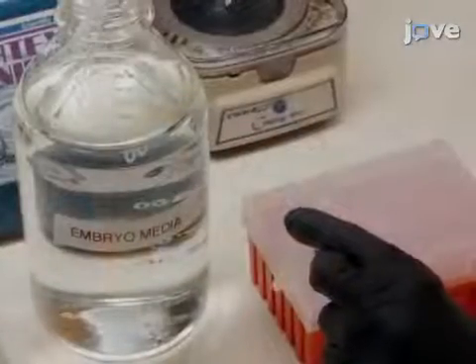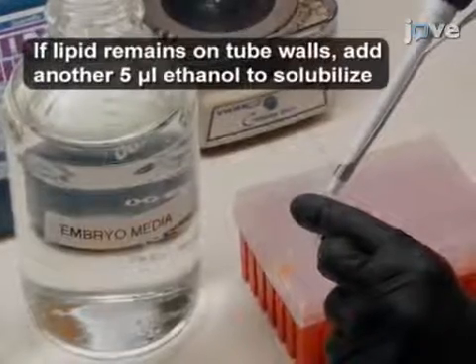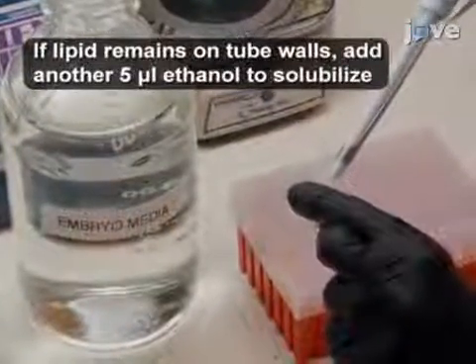Then, add 95 microliters of embryo medium and mix thoroughly by pipetting up and down until the mixture appears homogeneous. Protect the tube from light and store it on ice until needed.